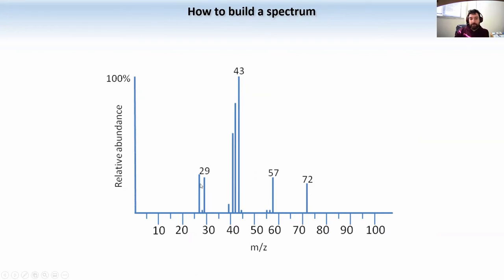So these molecules here that form this signal are the ones that hit the detector first, and then these, and then these, and then these, right? And the y-axis of the spectrum is how many molecules hit the detector at that precise time, right? Because the detector counts those molecules. So in the end, you can provide the two-dimensional graph where on the x-axis you know the mass, and on the y-axis you know the intensity of that molecule. And this is absolutely essential for the success of proteomics because we need to know how much of a protein we have, not only which proteins we have.